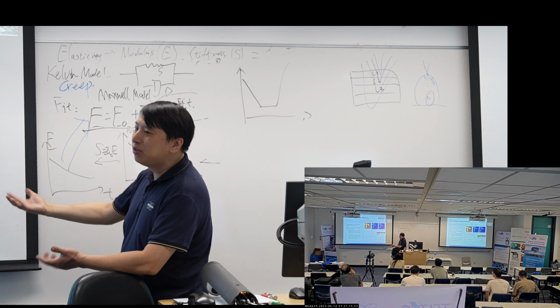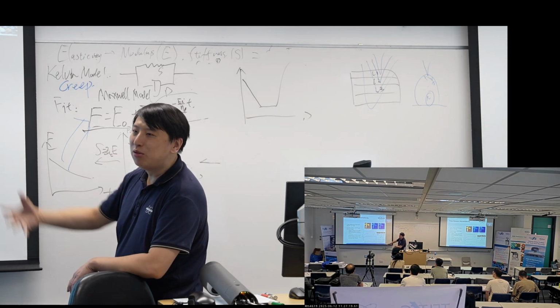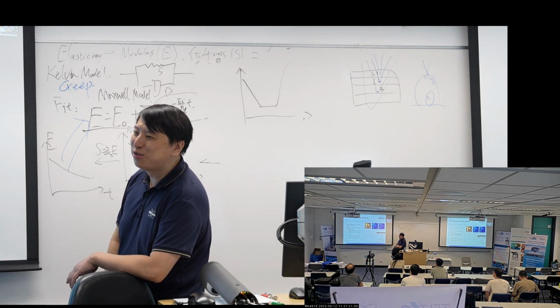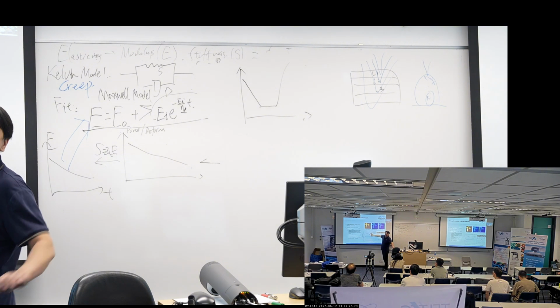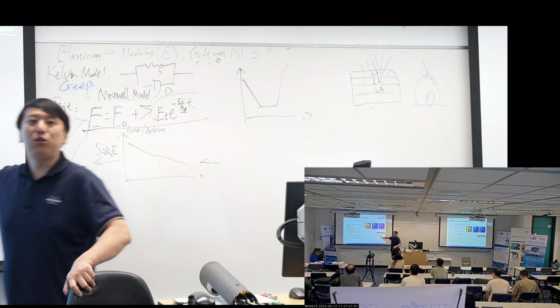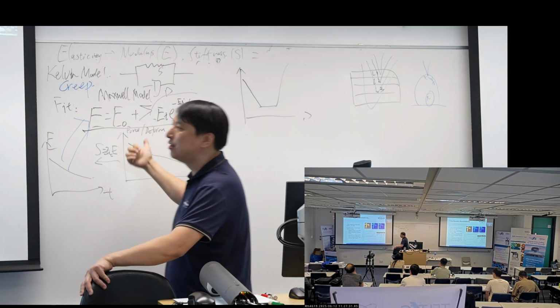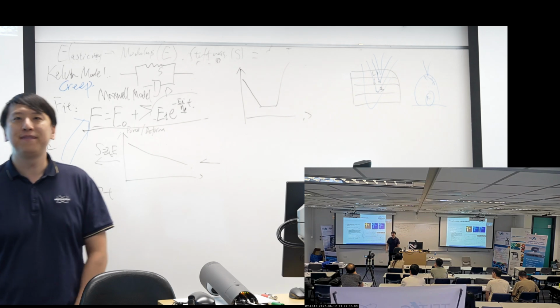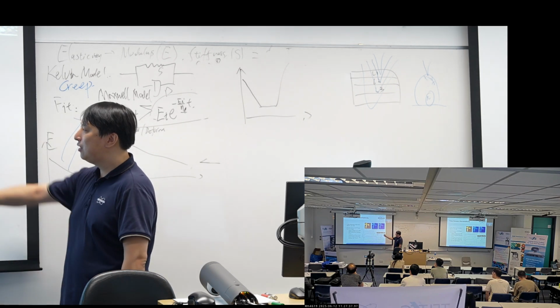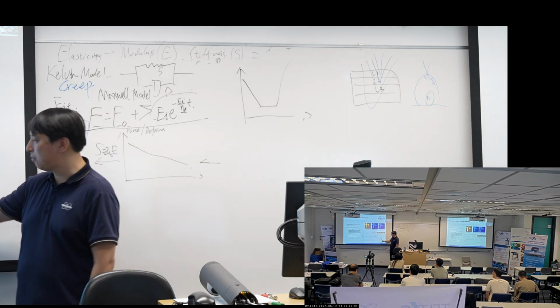And since Bruker did not give solutions for the data processing, and our professors, our users, don't want to do the job for Bruker, they stop here. So they do not fit the curves on the modulus as we showed. They just fit the curve on the Z, and they show something like this.